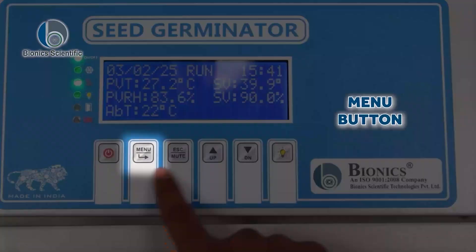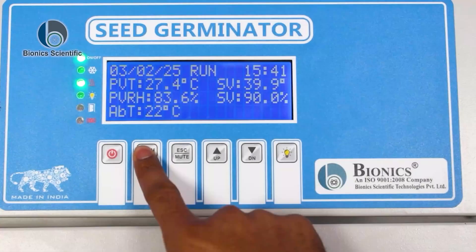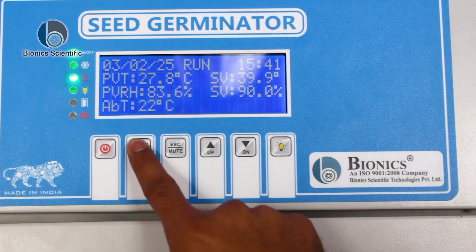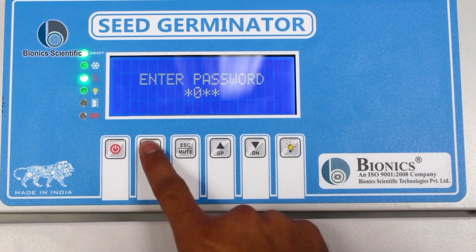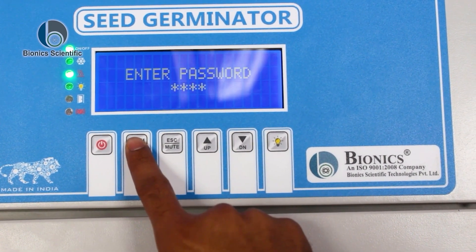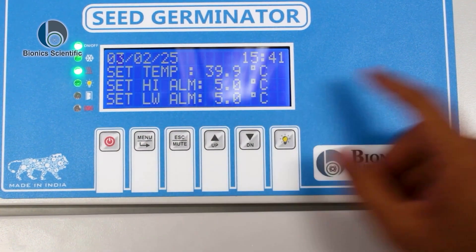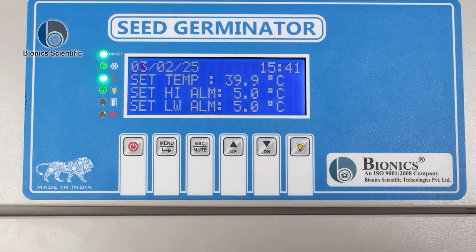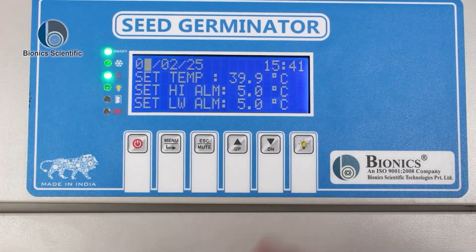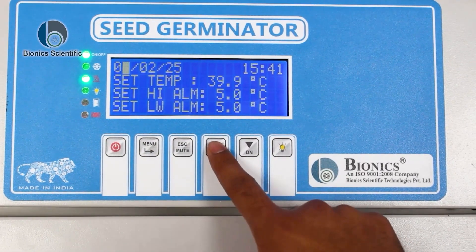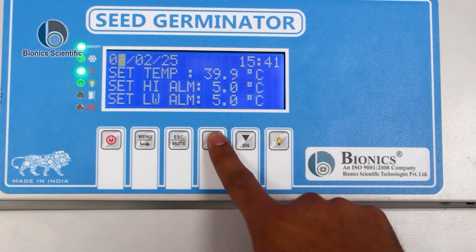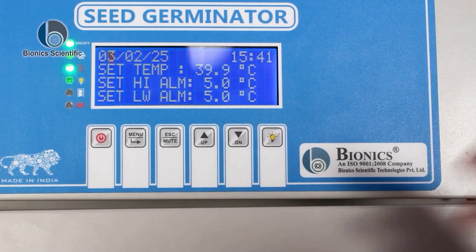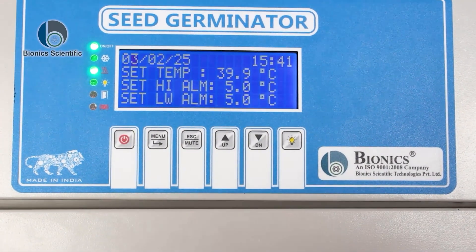Beneath that, there is a menu provision. You need to long-press the menu button. It will prompt you to enter a password — press this key, press this key, press again this key, then Enter. You can see there is a blinking. If you want to change something, you can cycle through the values. Once you leave it, it will change automatically by itself.